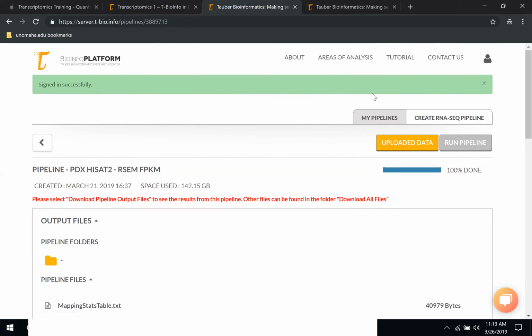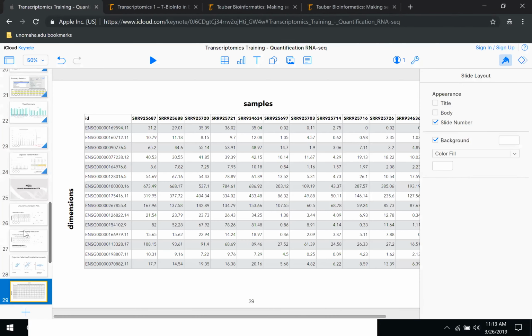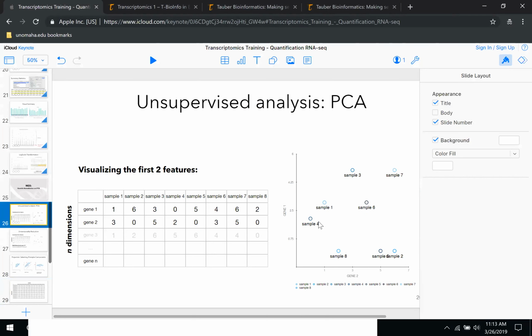No, I mean, for example, in the PCA plot that you showed us before, you have the differences in the samples and the expression levels, right? This is a PCA plot, and you have the PCA values for these two genes. Yes. For example, consider RNA-seq data, which has thousands and thousands of genes, and we have the information.